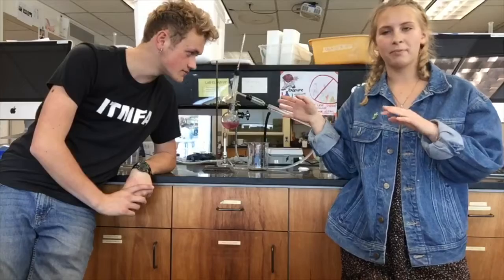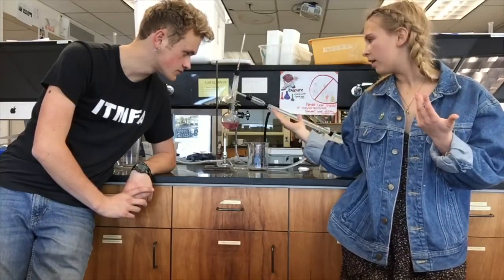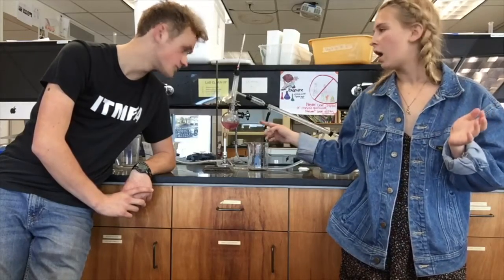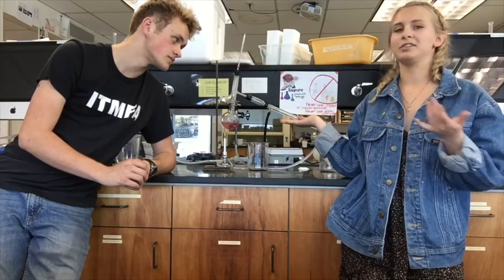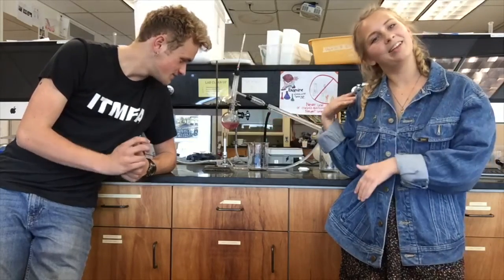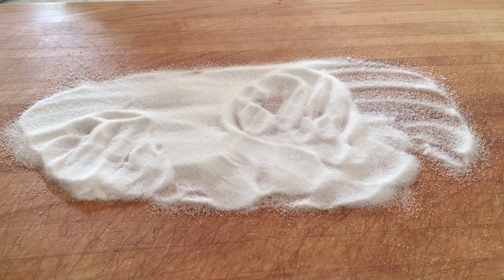As we learned in class, alcohol should boil off first and evaporate first because it is less polar than water. So if you heat the liquid at a low enough temperature, the alcohol should evaporate without any water evaporating. We tried this at first, but it did not work. So we just evaporated the solids out and then calculated the percentage of alcohol in the final product rather than doing it through volume.